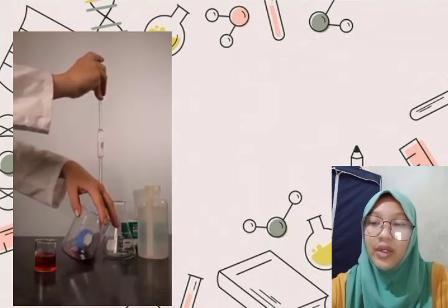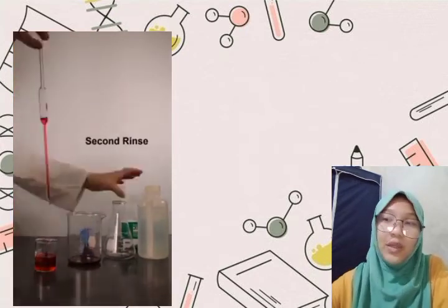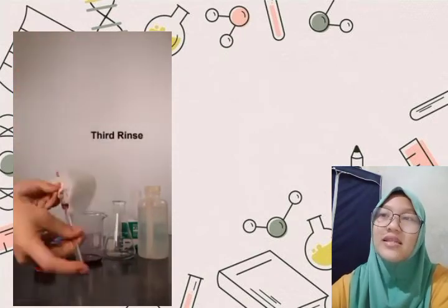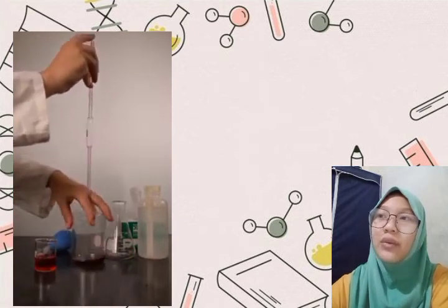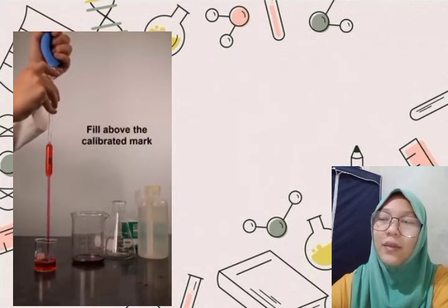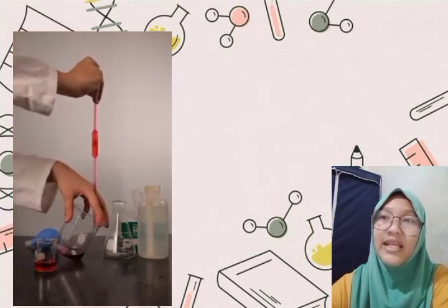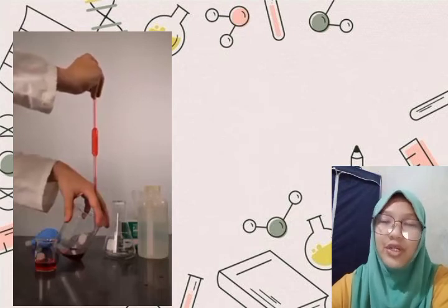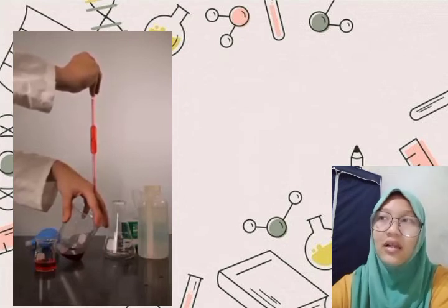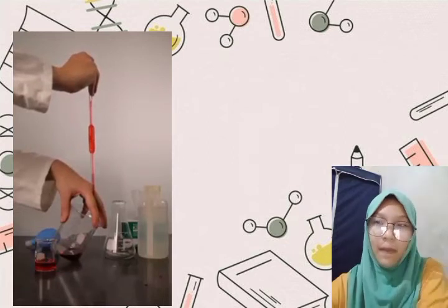The next step is to withdraw the tip of the pipette from the liquid and wipe it with tissue. The last step is to hold the pipette vertically with the tip gently pressed against the inside of the beaker as shown. Carefully release the pressure of your finger against the end of the pipette and allow the liquid to flow out of the pipette until the bottom of the meniscus is exactly even with the calibration mark. Stop the flow of liquid, tilt the pipette at a slight angle, and dispense the liquid into conical flasks or receiving vessels.